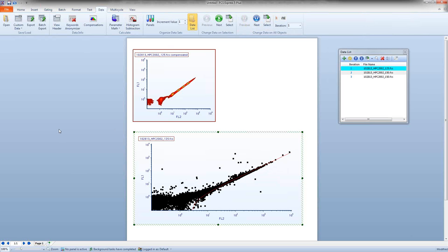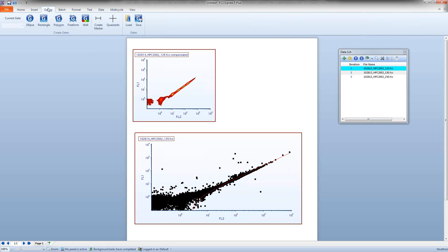So inserting these scatter regression plots is very easy. You just click on the insert button, insert scatter regression, and we're automatically going to try and determine a best fit for this data.